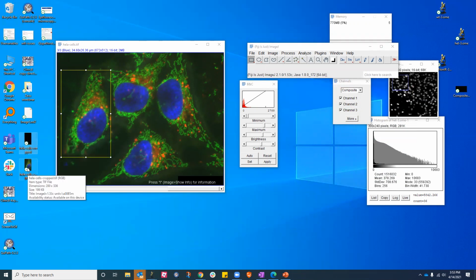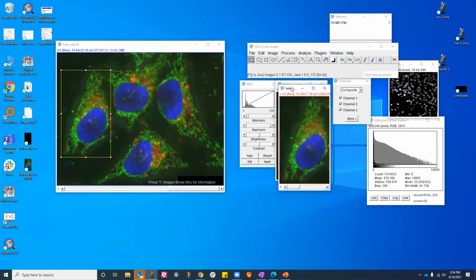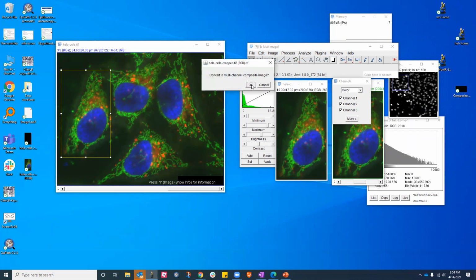And if I click this RGB image, a single image opened. There are no multiple channels that I see, right? But when I open this TIFF file, which is not an RGB stack, I still have options of changing brightness and contrast for each of the channels, right? Which I do not have the luxury in the RGB image, unless I go to stacks and say color, and it will convert the image to individual channels.